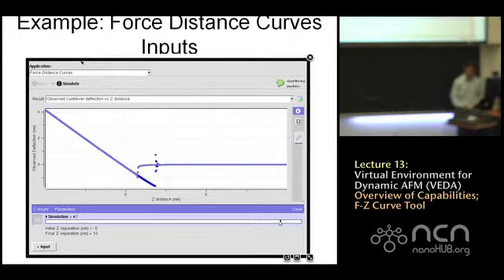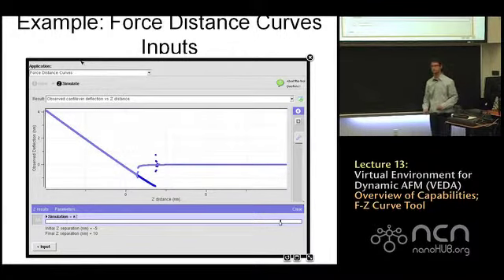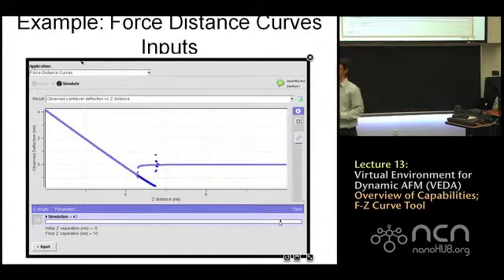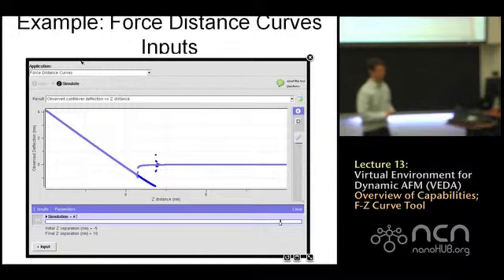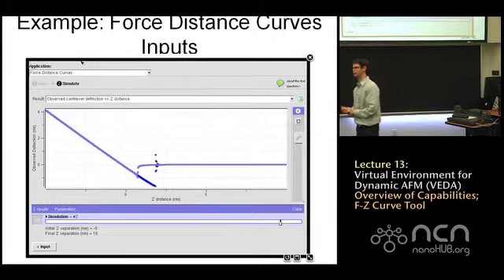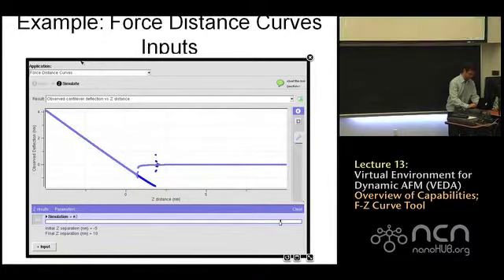And finally, we can actually do the retraction curve. This got put out of order. Sorry. If you go back to the previous page, I'm missing the input slide for this, but what you can do on the input for the operating conditions is invert the initial and the final Z separation. Maybe I can do this on the web page.